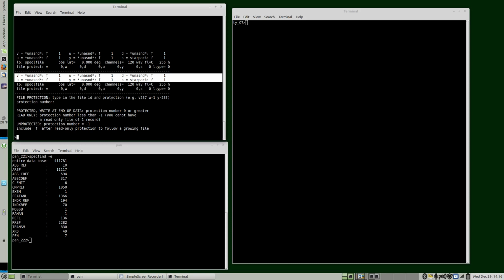Now, to do that, we need to have unique file names, and we need to have a way that we can trace that history, and that's done in SpecPR by the SpecPR file name and record number. To limit the size of file names in the histories, the SpecPR file names must be no more than 8 characters. So you'll see that commonly.